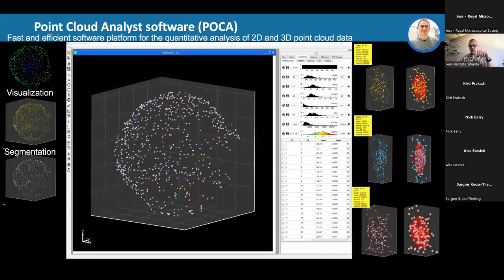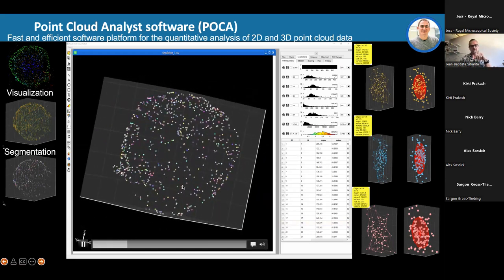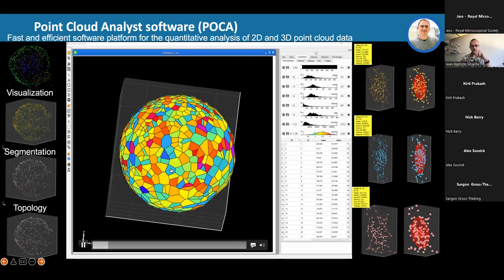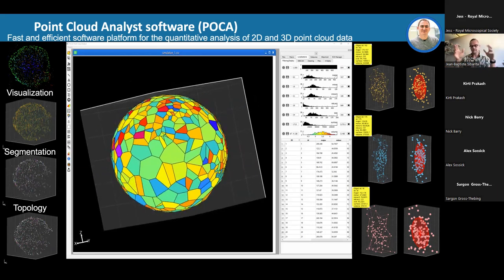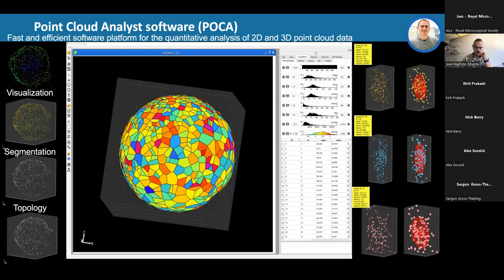which is something that we can now access with the light sheet, to look deeper into the sample, and now looking at the topology of the clusters, and also a very cool thing is using what we do in 2D for localization analysis to now do the cluster analysis and look at their distribution. This is another feature. It's very nice because this is multi-scale, but using the exact same tools that we have used for single molecule localization. So this is under development, but the software is already released and publicly available. It has a lot of cool features I don't have time to go through.